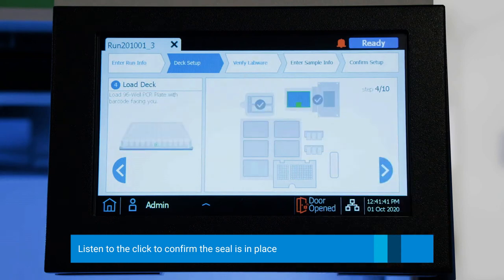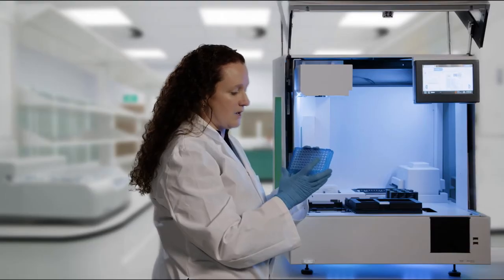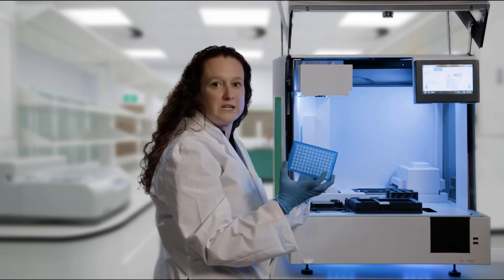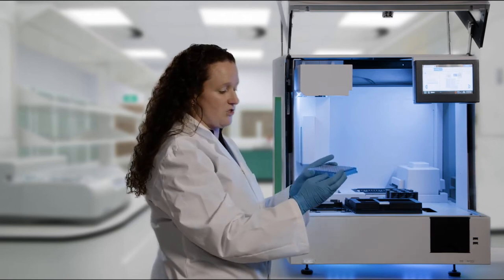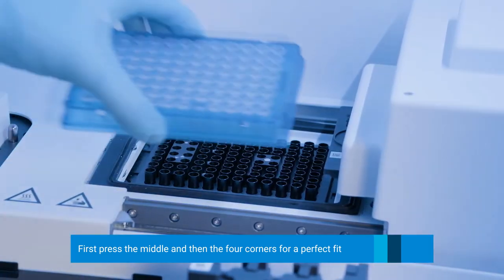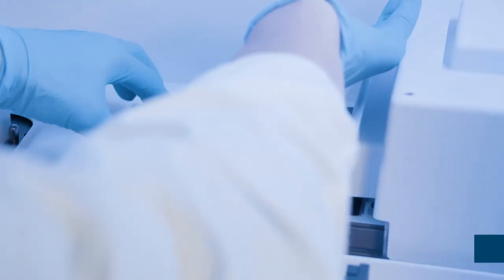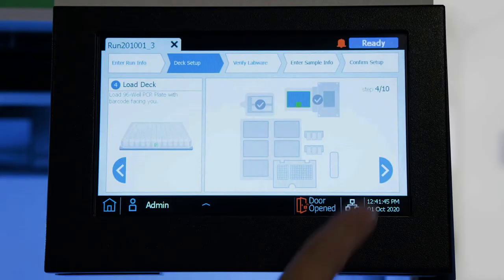The next thing is to add the PCR plate, also found in the consumables box. We'll face the barcode to the front. When you load this onto the deck, you want to make sure that it is level — push to the middle and then the outside four corners. Now we will click Next.